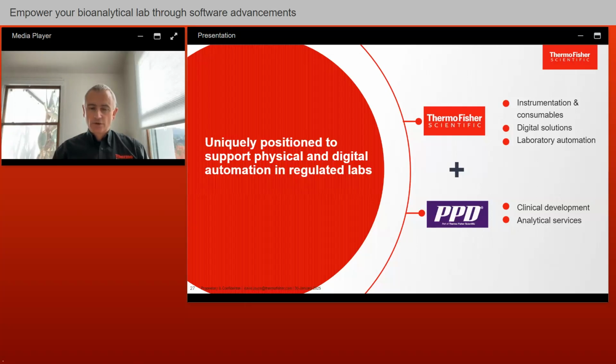During the COVID era, they had a huge push towards automated liquid handling and automation of the activities needed for bioanalysis, obviously mainly for the testing of COVID tests, out of necessity. You wanted as few people in the lab as possible and as consistent a result as possible because people's lives are on the line.